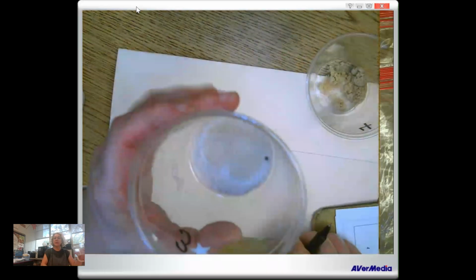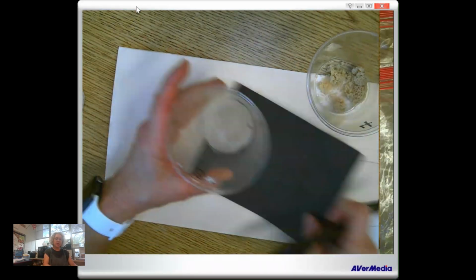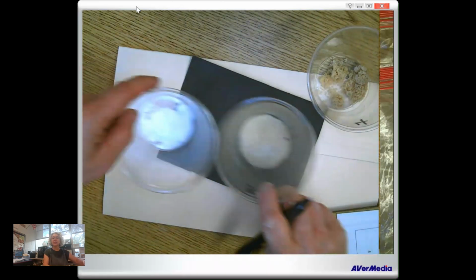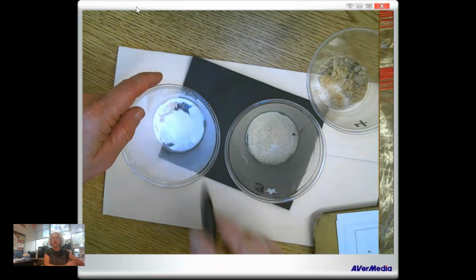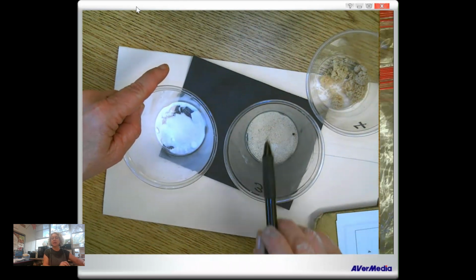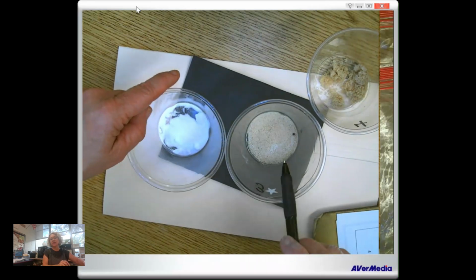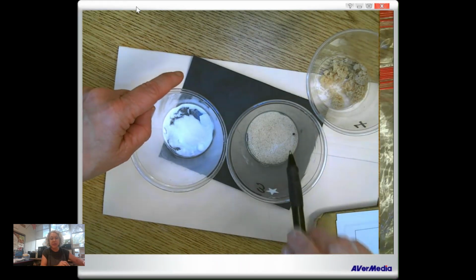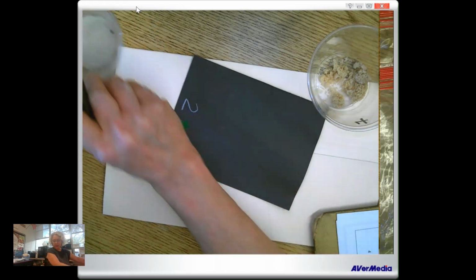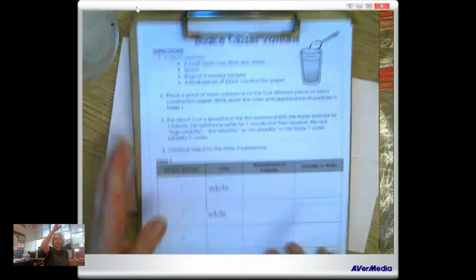All right, now we've got 3. And 3, that on camera looks lighter than it is. Let me put it under black and see if that helps. And let me put white next to it. All right, now that I have white next to it, you can see that's not white. So this is a tan color. Tomorrow on the sheet they're going to ask you to find the brown substance. So they are calling this brown. We think it's tan though, so we're going to write both.